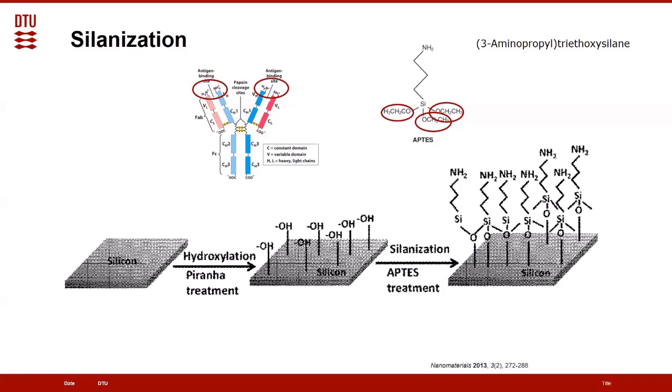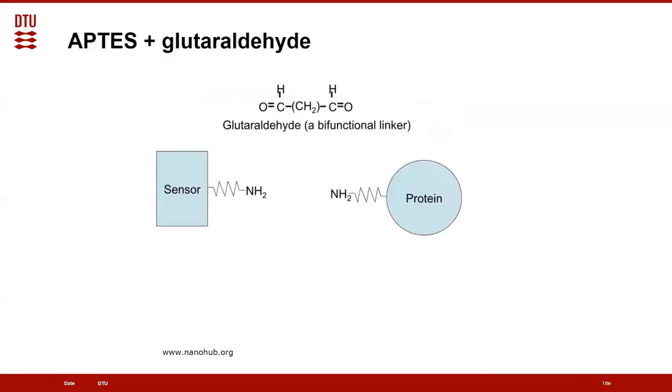And we can do that by gluing this together with a molecule called glutaraldehyde. Glutaraldehyde is a bifunctional linker, so it has the same reaction at two sides.